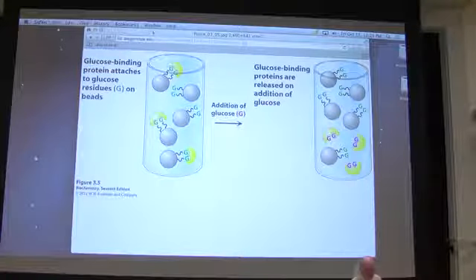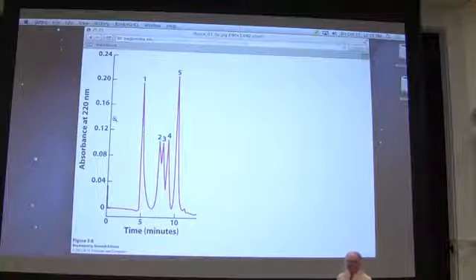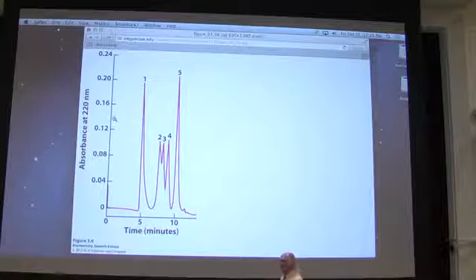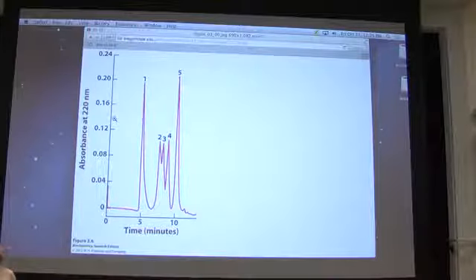All right, so we now know about affinity chromatography. Let's talk about a more advanced technique called HPLC. How many of you in here have ever run HPLC? Probably several of you have. Yeah, a few. Okay. So HPLC is a technique for separating molecules on the basis of their polarity. Not their charge, but their polarity.